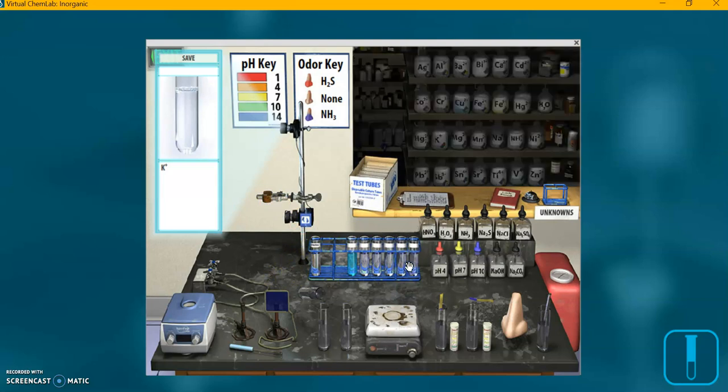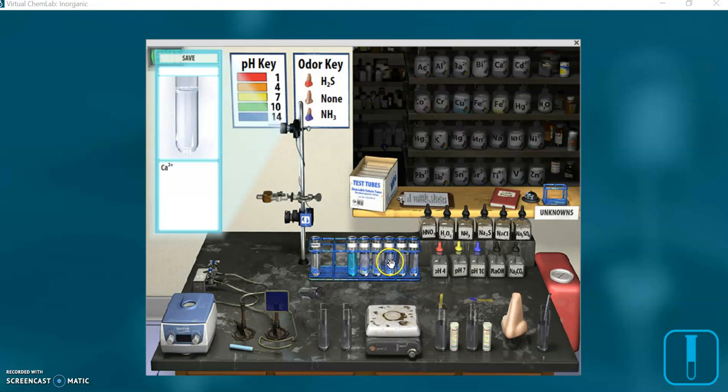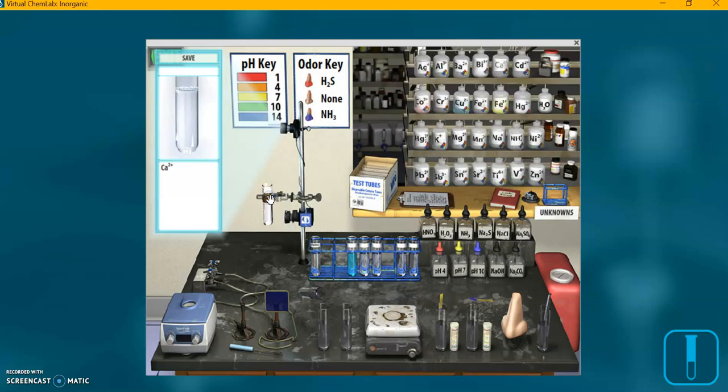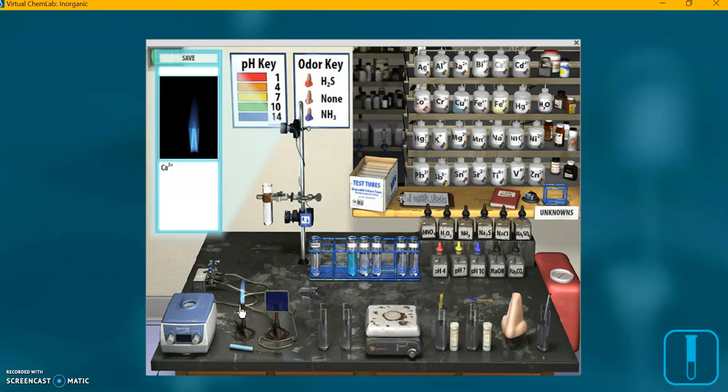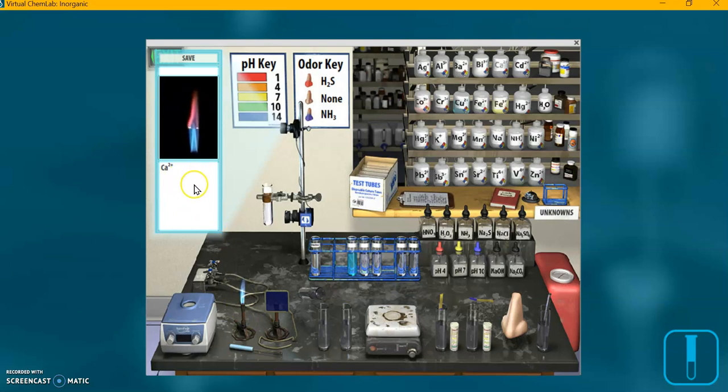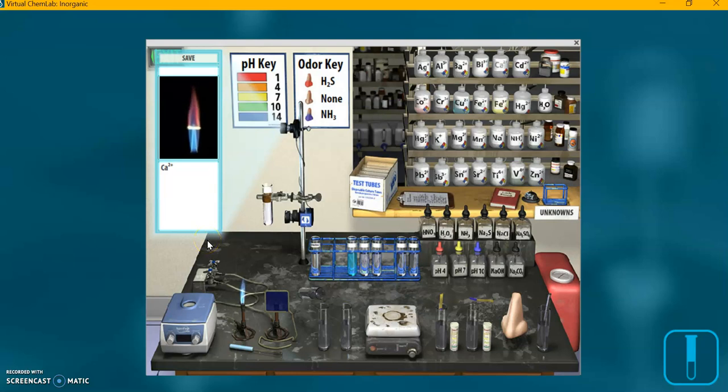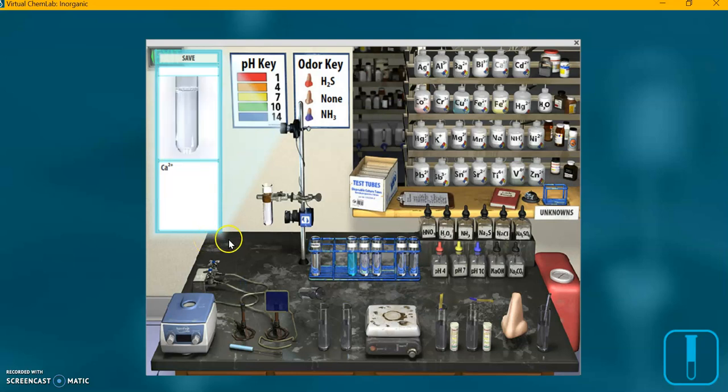Okay. Put that one back. I'm going to repeat the procedure with the other test tubes. So we have the calcium-filled test tube. Let's click on the flame, see what we have here. Wait a few seconds. There we go. We've got a color.